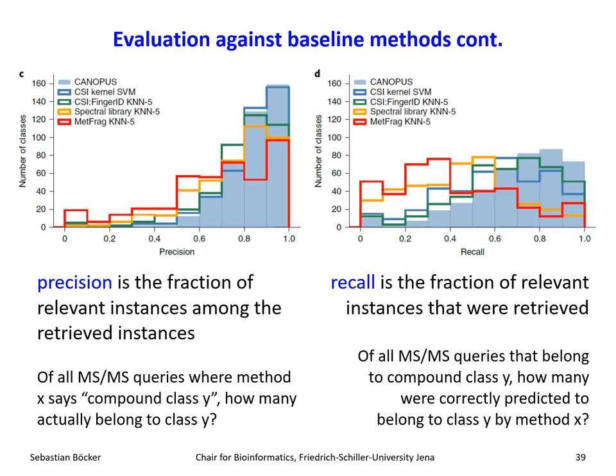And you see that there are two very good methods with regards to precision, and that is the direct prediction, which is very good with regards to precision, but CANOPUS is as good as it, and the other methods are a little bit worse. But then there's also recall, and recall is very important. How many of the positive examples out there, how many sphingolipids do we actually say, yes, this is a sphingolipid? Because saying no all the time is a valid answer, but it's not a really helpful one, right?